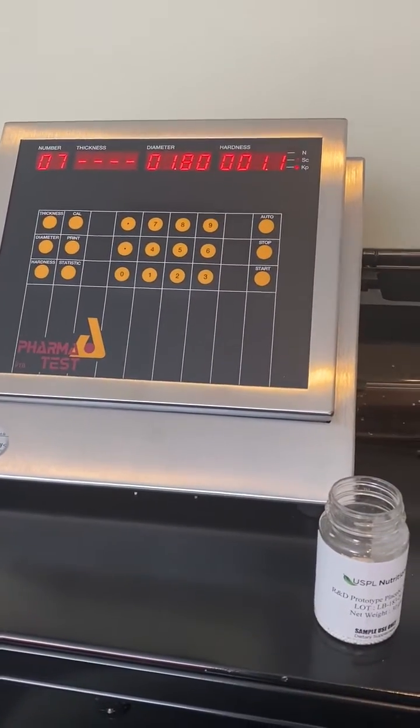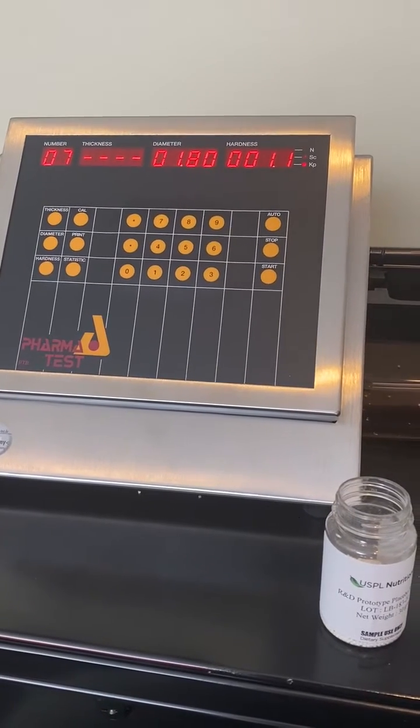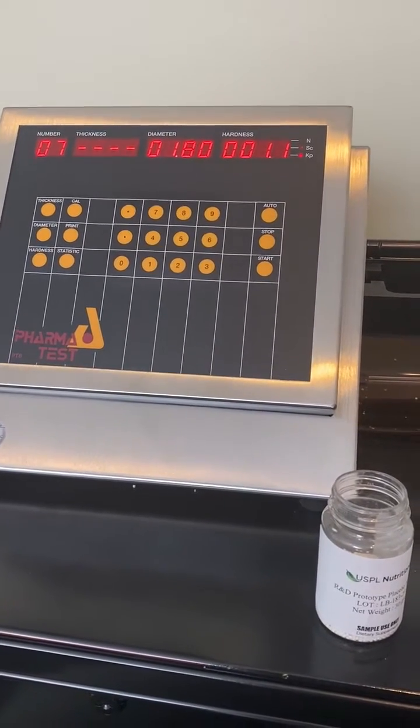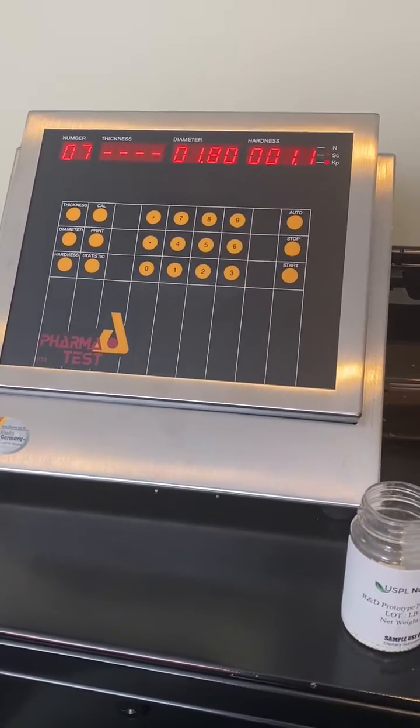Hello, this is the demonstration of the PharmaTAS PTB 311 tablet hardness diameter and thickness tester. This has a 300 Newton load cell.